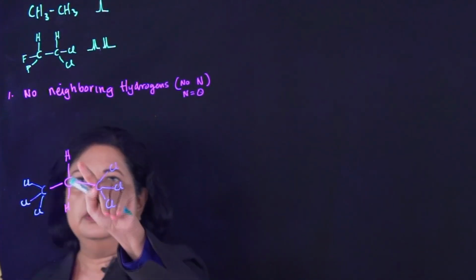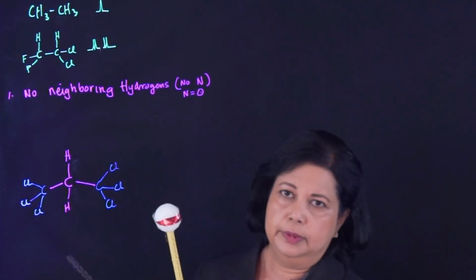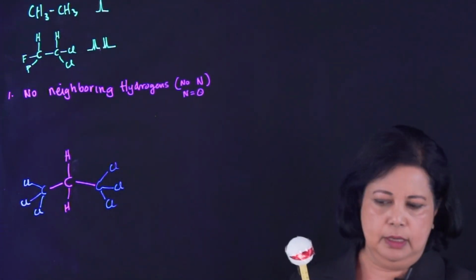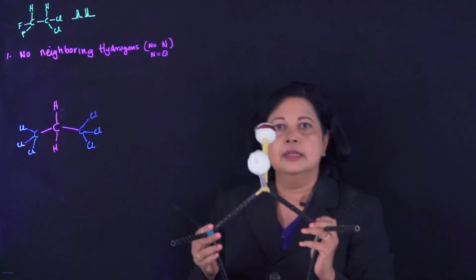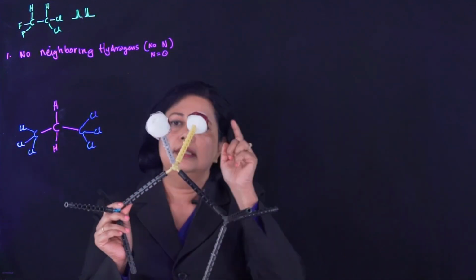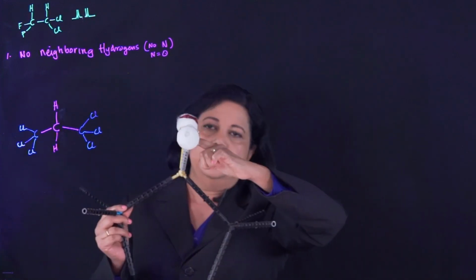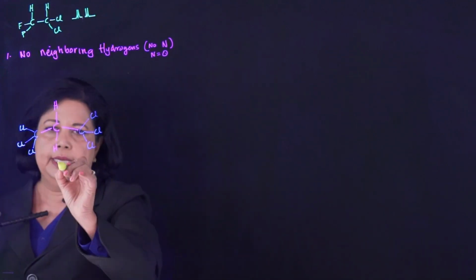So here, this is two bonds here. Two bonds on an alkyl do not couple. So these two here are not going to couple. So let's say there are two protons on the same carbon and they're alkyl groups, they are not going to couple. So if you have two hydrogens with no neighboring hydrogens, these two on an alkyl group are not going to couple. Okay, so therefore both of these would only be a singlet. So here you would get a singlet.